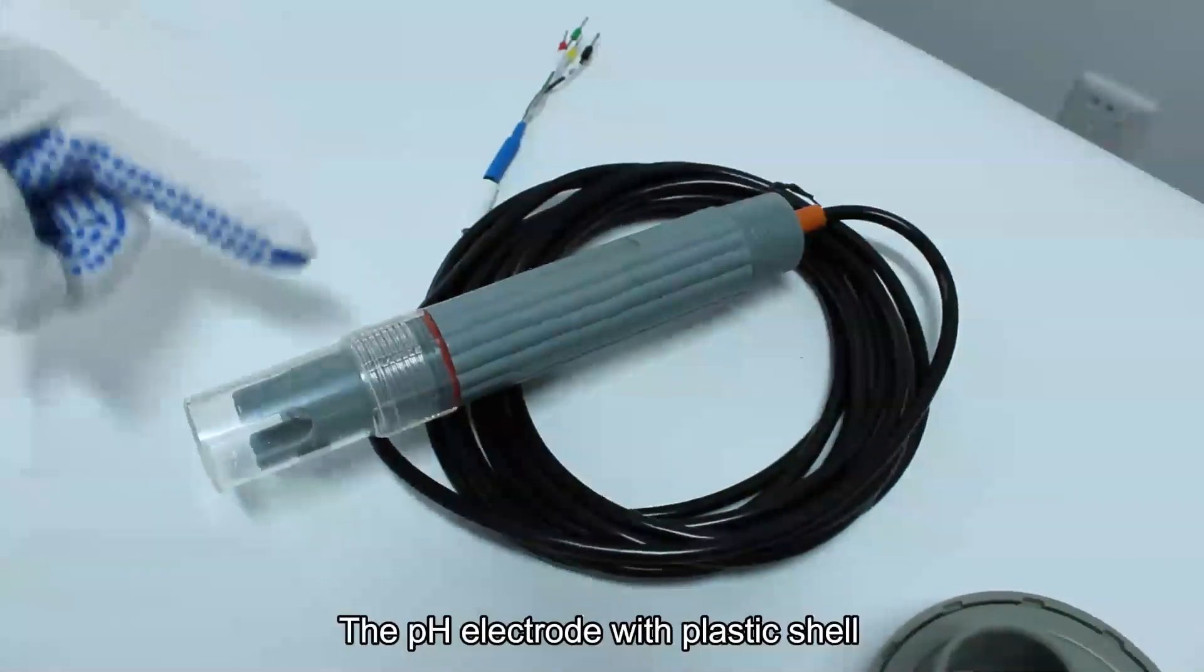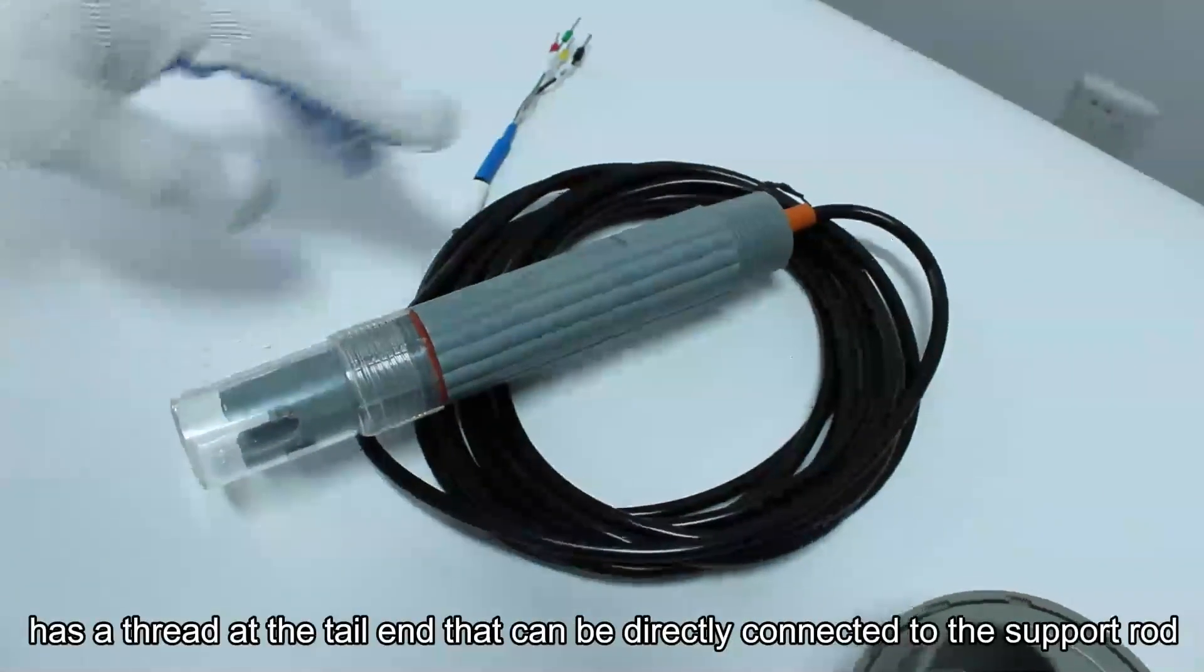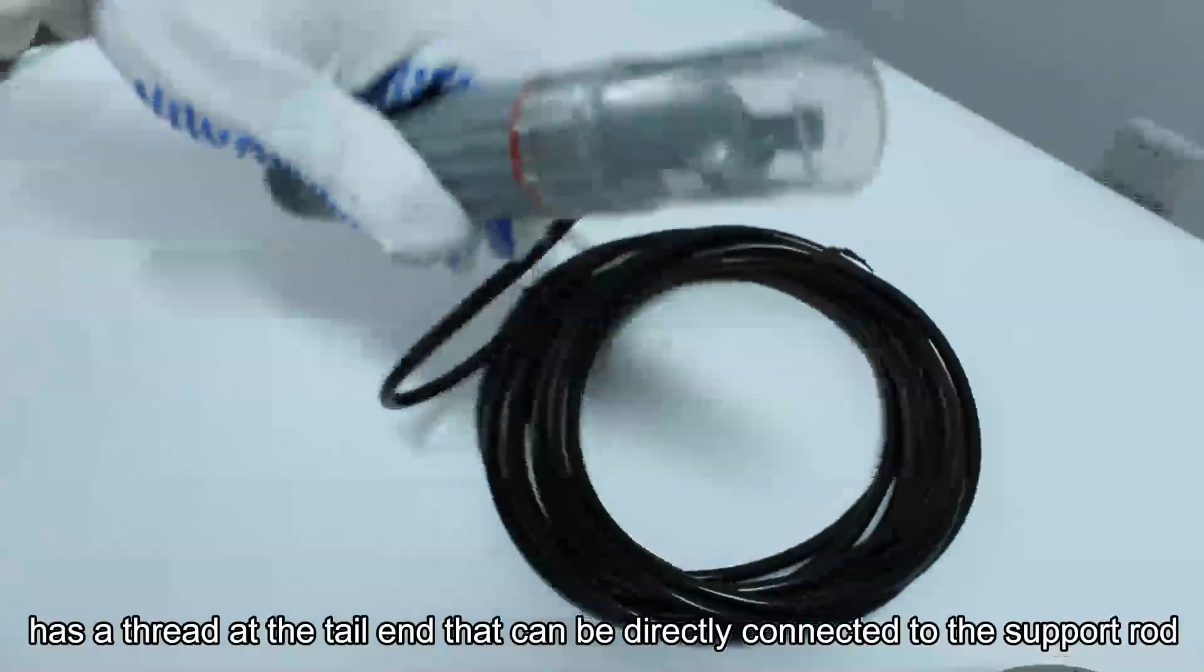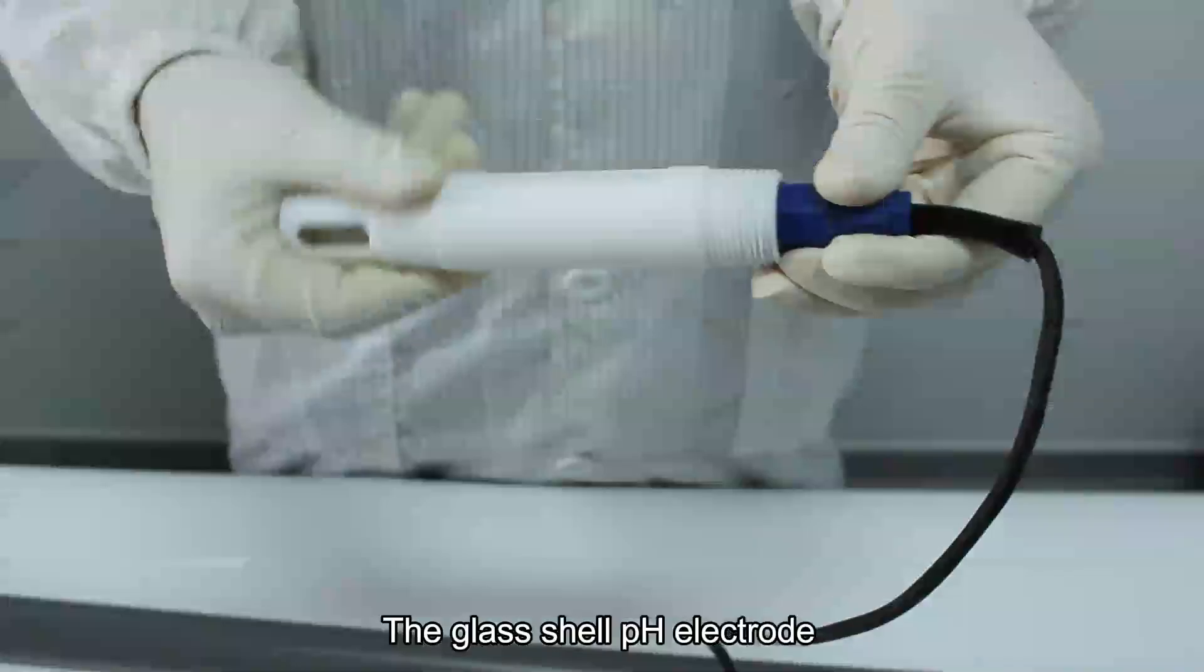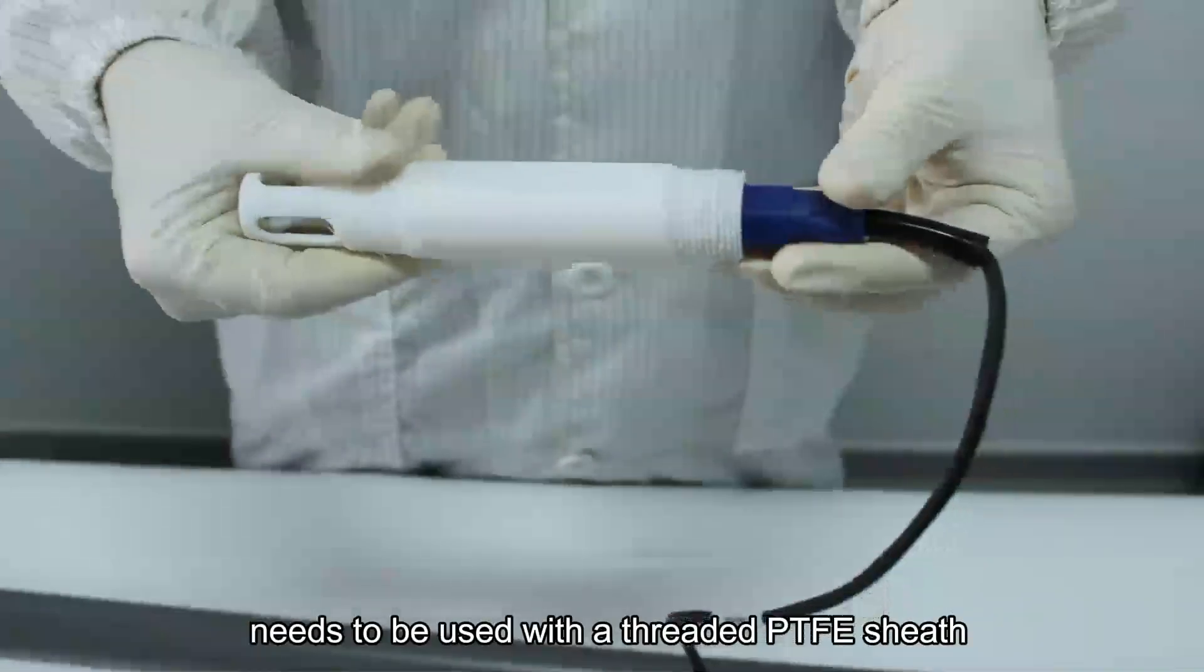The pH electrode with plastic shell has a thread at the tail end that can be directly connected to the support rod. The glass shell pH electrode needs to be used with a threaded PTFE sheath.